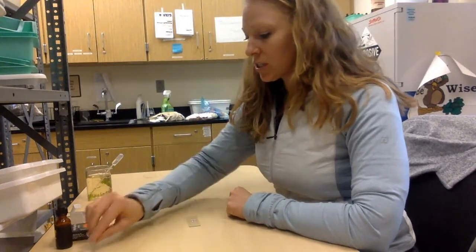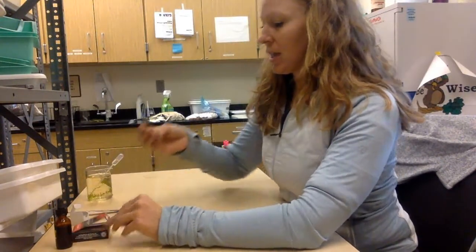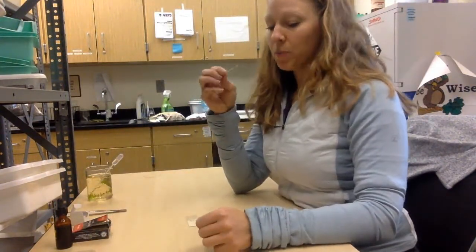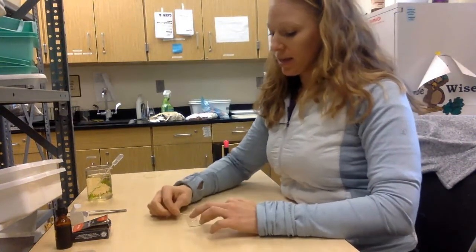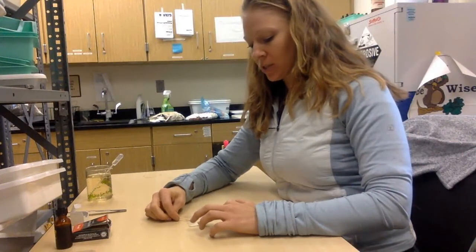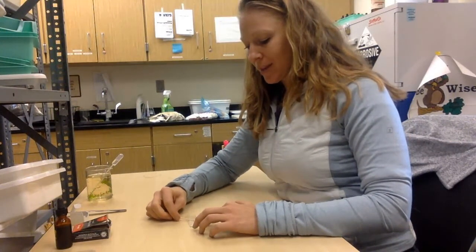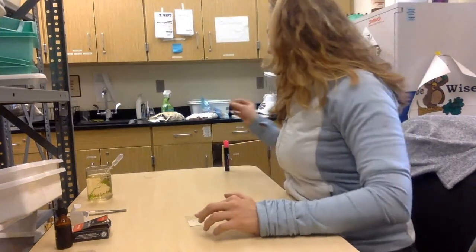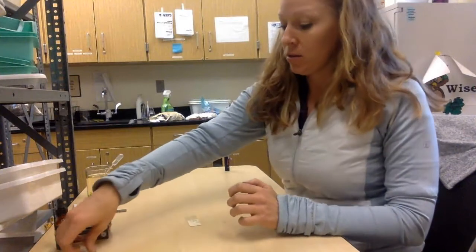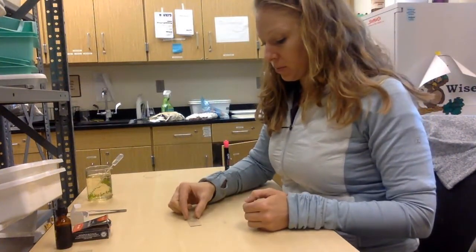For the cheek cell, what we're going to do is take a toothpick. You're going to scrape the inside of your cheek like this, and you're going to get those skin cells, these epithelial cells from your cheek, and you're going to put it right in that little puddle of water. Throw this out right away, and you're going to put your cover slip on just like this.